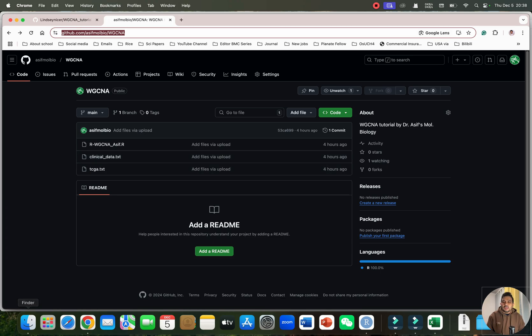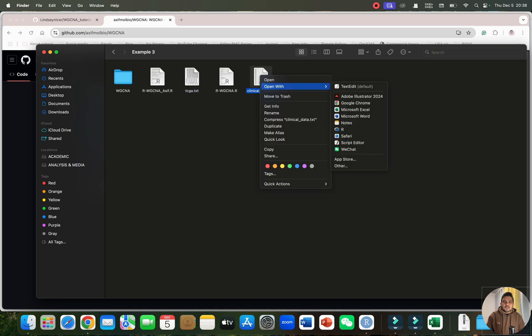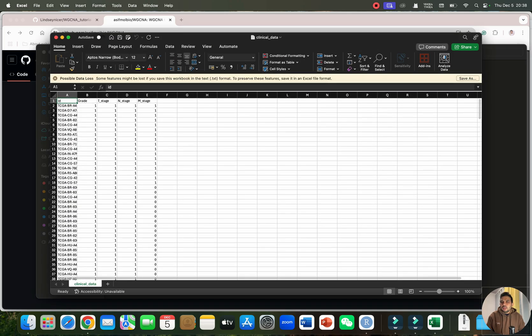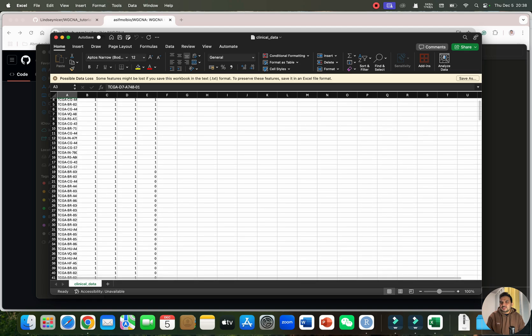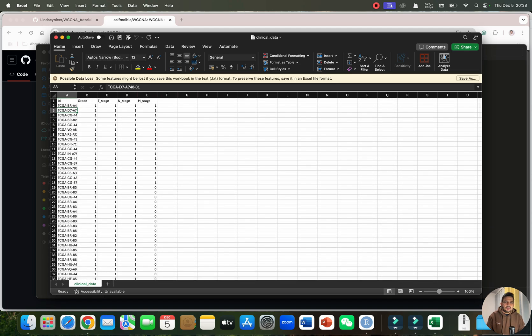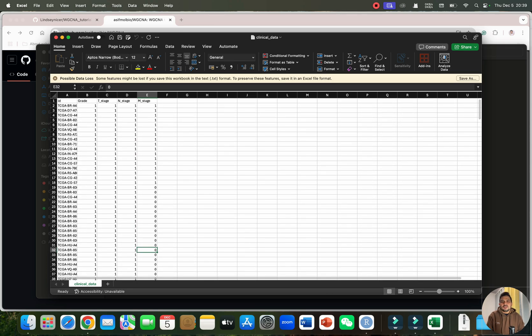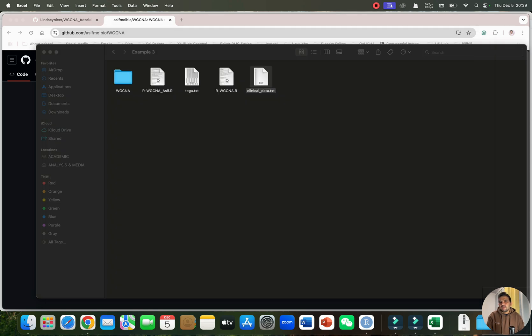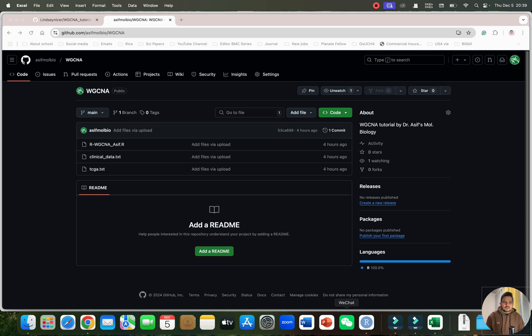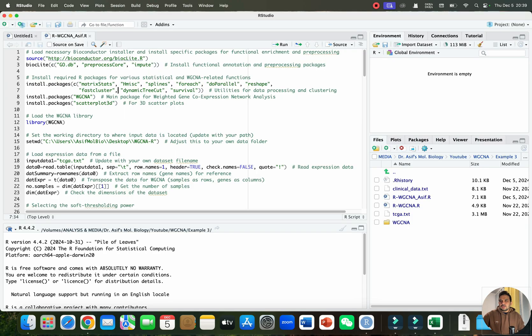In the clinical data file, we have different sample names — the same ones that appear row-wise in the gene expression file. We have different stages, and we have assigned one and zero to quantify: if a trait is present we assign one, if absent we assign zero. This is the clinical data we will use for WGCNA analysis.